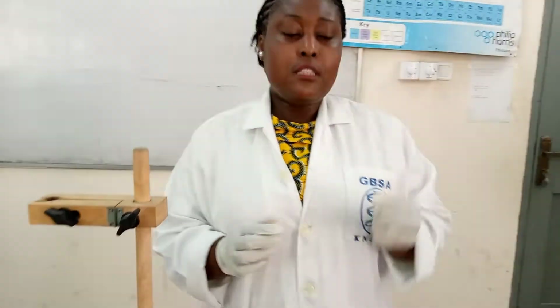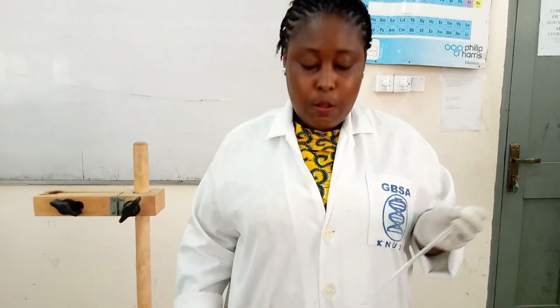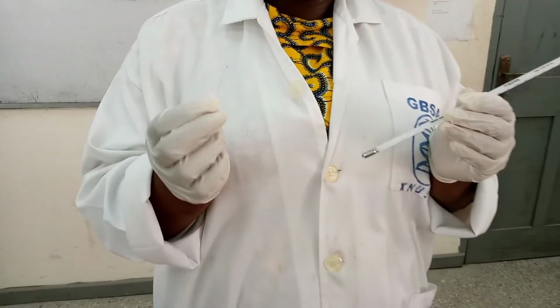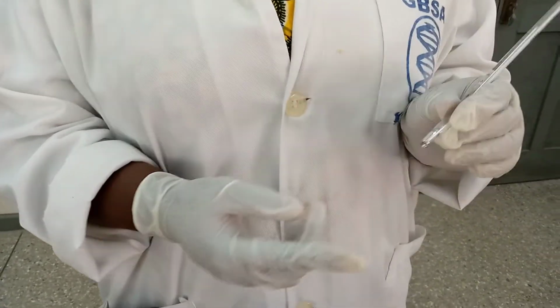So after doing this, then I'll bring my mercury thermometer out, because I'm going to use the mercury thermometer to record the temperature. So it's very important. Now, how am I going to do it? I'm going to tie the tube, the capillary tube that I've filled with my unknown sample. I'm going to tie it close to the bulb of the thermometer.